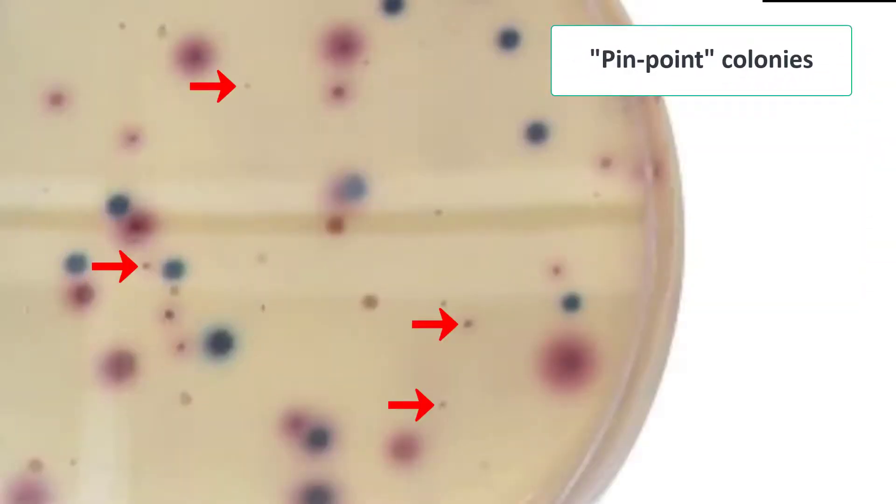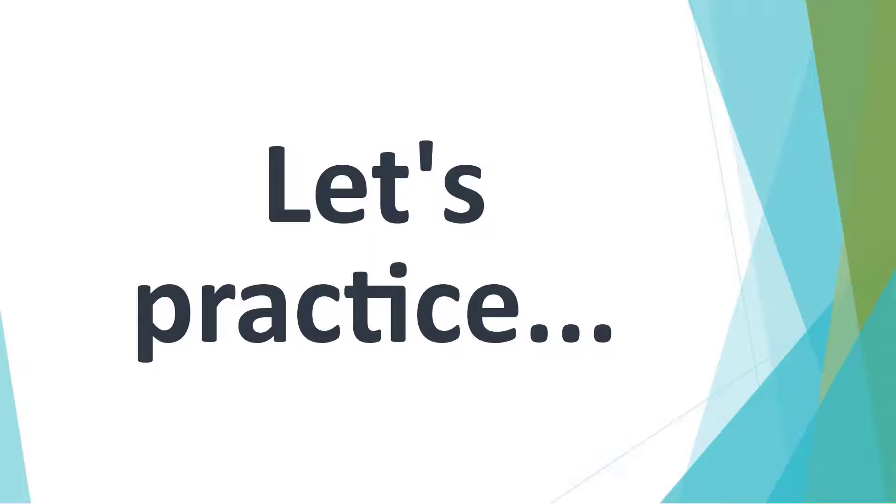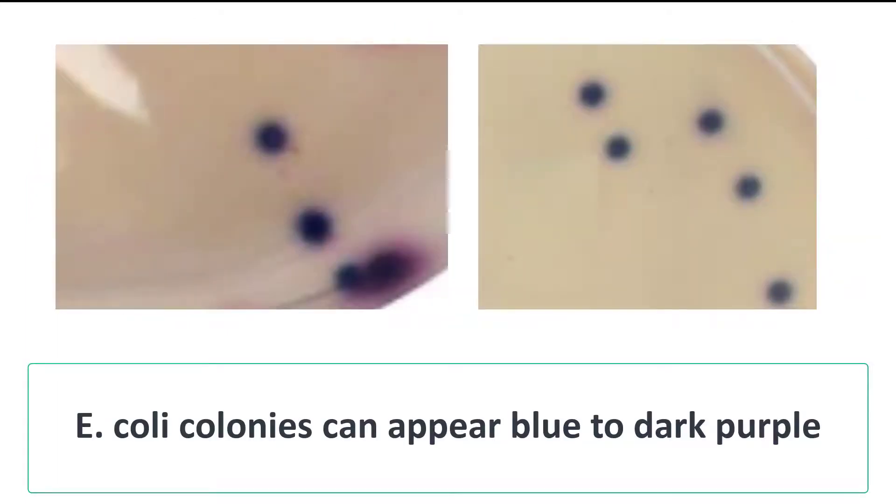These are just a few examples of pinpoint colonies that are too small to count. Also refrain from counting brown, yellow, or white colonies as seen here in circles. Now let's practice counting E. coli colonies. Count all of the blue to purple colonies on each plate as E. coli.